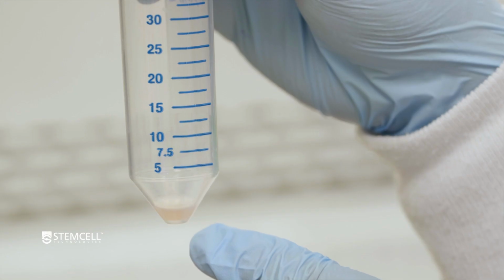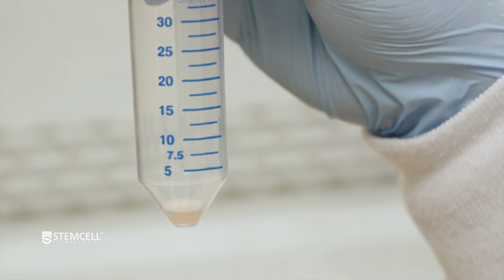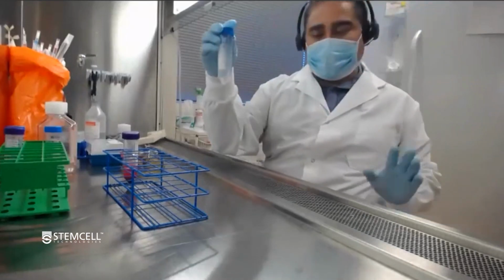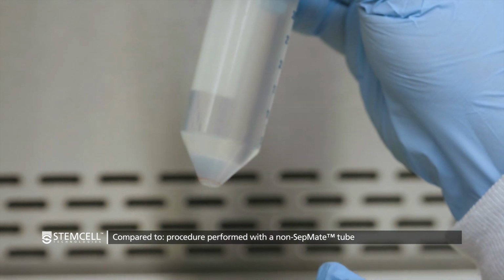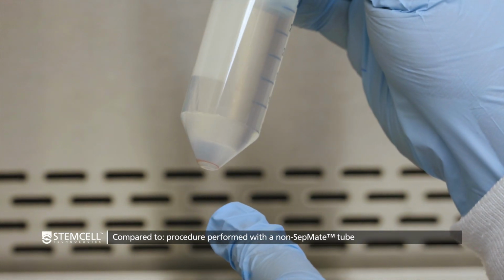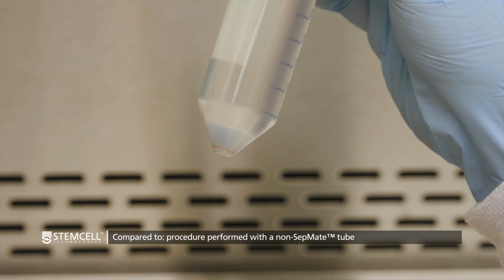So we're just looking here how after we've agitated the pellet, some of those red blood cells will go back into solution, and so they will give a bit of an orange or pink tinge to the color of the pellet. That's perfectly normal. So here we've taken out the non-SepMate spin after 300 times G 10 minutes, and you can see that at least with this donor, it's very similar to the SepMate spin. So there is a little bit of red blood cells among your white blood cell PBMC pellet at the bottom.